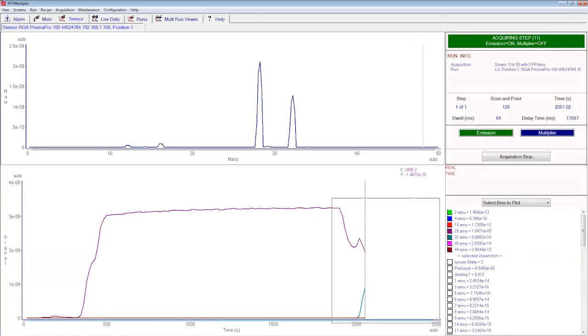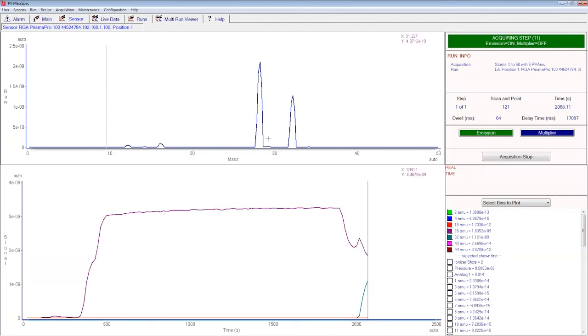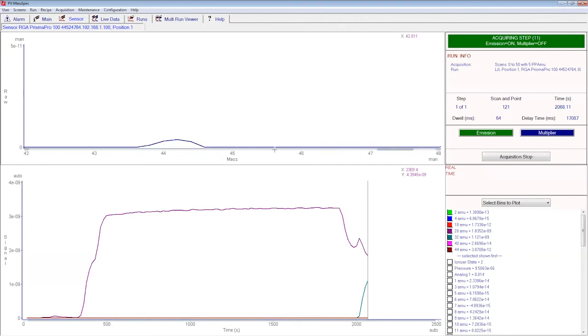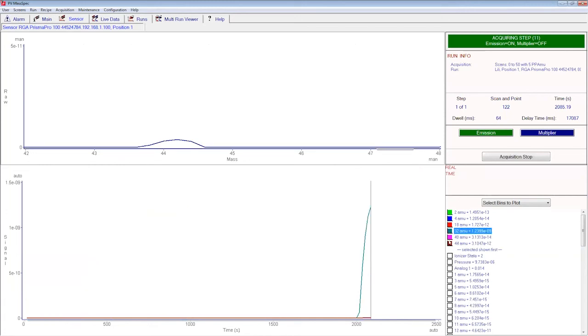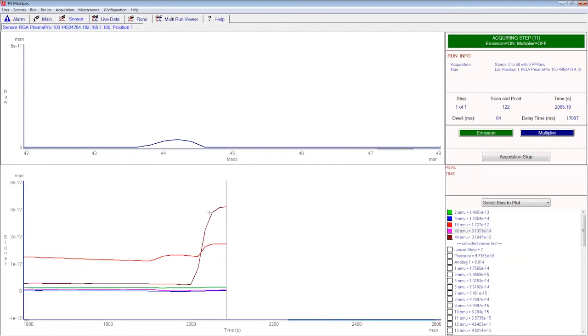This is going, CO and oxygen. But so far, no CO2 at all. True, 44. At room temperature probably maybe a little. It might be just the background. We don't know if it was there before or not. Actually, you can enlarge it here. Or just pick out those 3. Remove it, yeah. Okay, it's coming actually. So you see the background was.